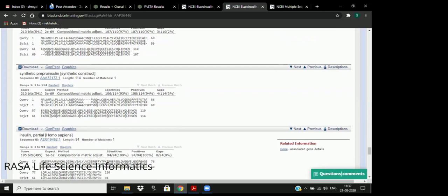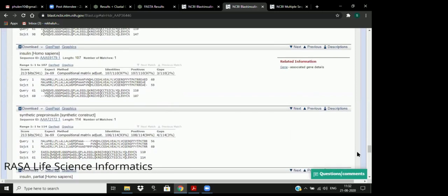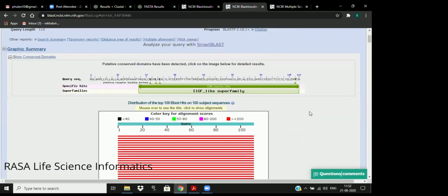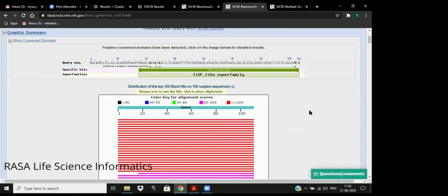Okay, now coming back to the top. So in short, the alignment is supposed to be studied with plus sign, alphabets, and look out for the gaps. Gaps should not be there in the subject. Gaps in the query do not bother me much. Okay, but you will do the alignment for which queries? The ones which are showing you good scores.